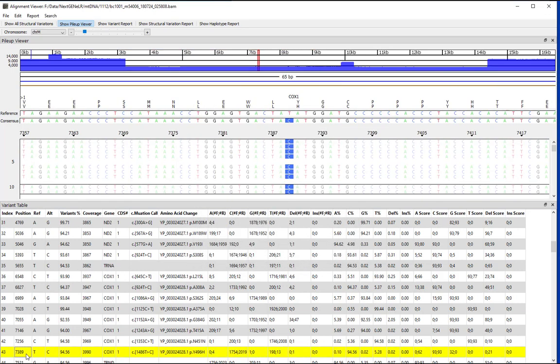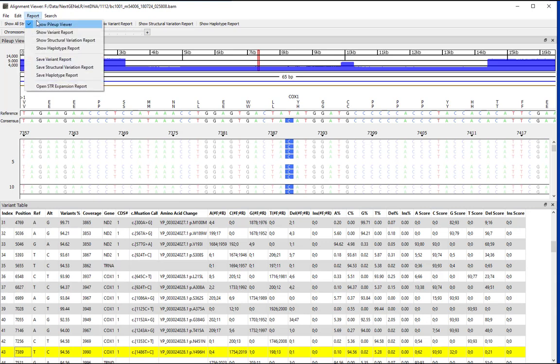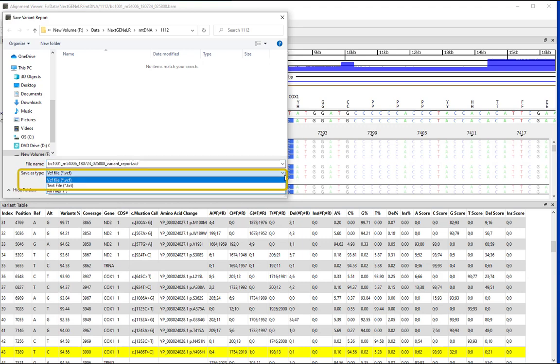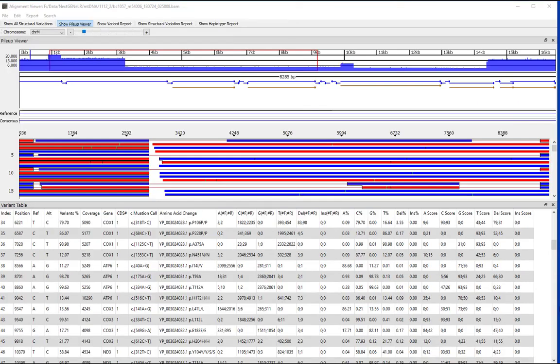Double-click any variant to bring the variant position into view. You can select Save Variant Report from the Reports menu to save the variant report, choosing to save it as either text or VCF format.